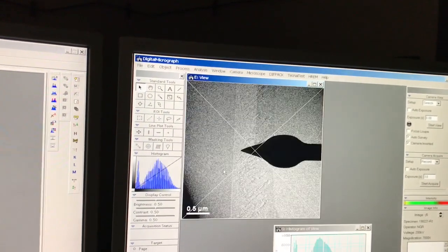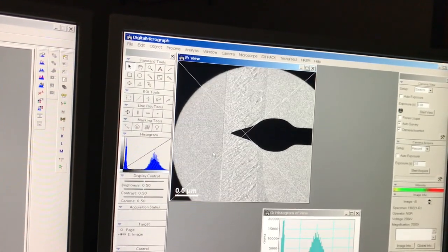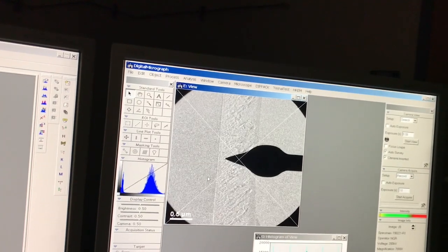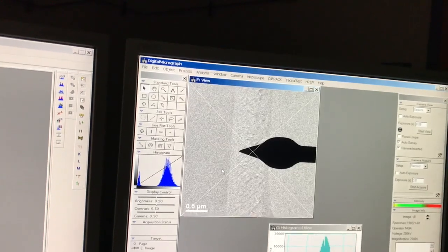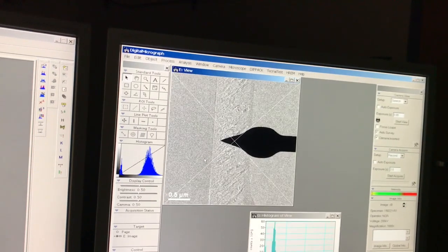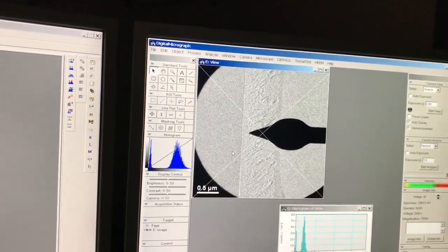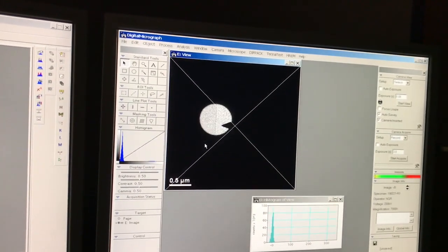If I go to number 3, you can see this is substantially larger. This is microns in diameter, but you can see I'm still limiting smaller than the area I'm illuminating. But if I go to 4, I'm not actually limiting anything anymore. This is actually bigger than the beam. You can't see it, but at this point the aperture doesn't help me at all. Okay, so that's a little bit smaller, again not small enough to isolate one area from another. This is the one we were using.